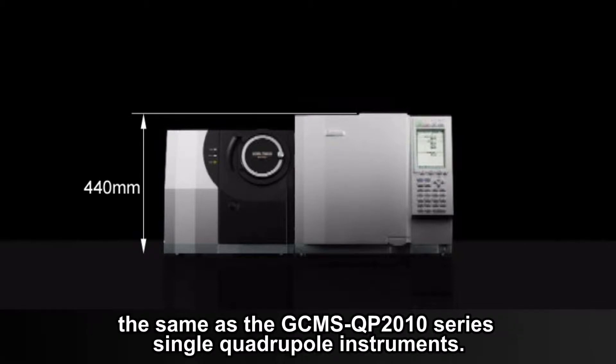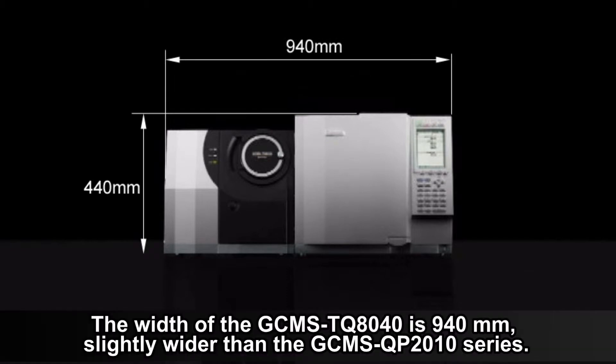The width of the GC-MS TQ8040 is 940 mm, slightly wider than the GC-MS QP 2010 Series.